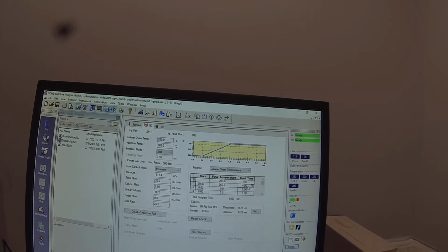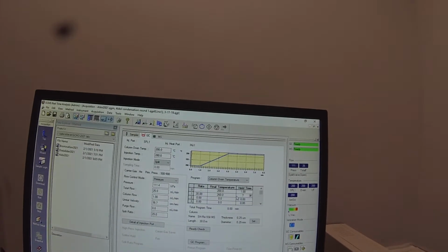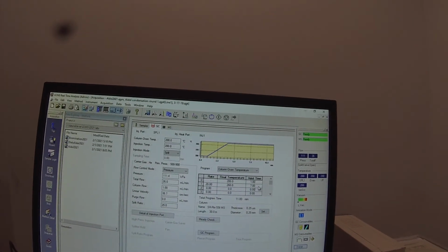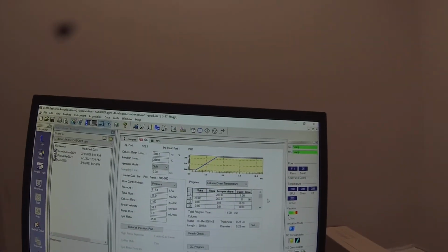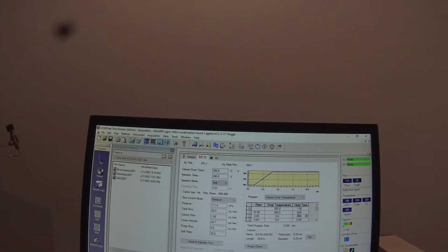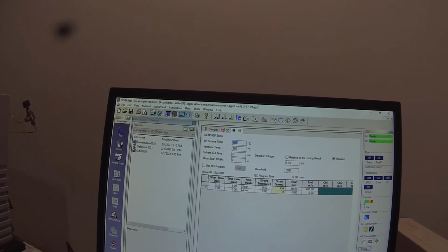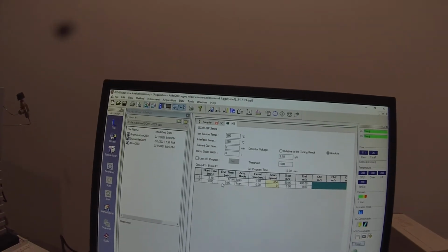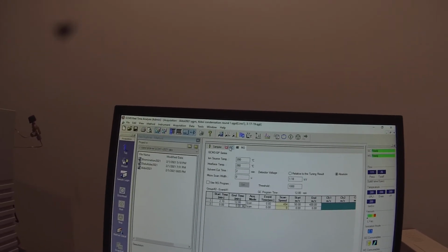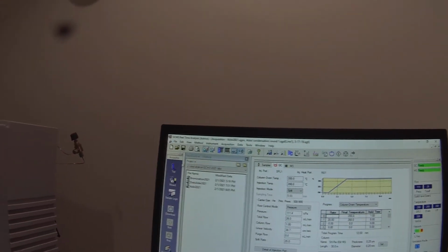And then I'm going to hold that for 7 minutes. Actually, I'm going to hold it for 8 minutes. I'm going to hold it for a good long time. So it would be a 12-minute run. I'm going to stick with the 1 mil per minute rate. I just need to change this to 12 so that the mass spec continues to collect data. We'll save that method file.